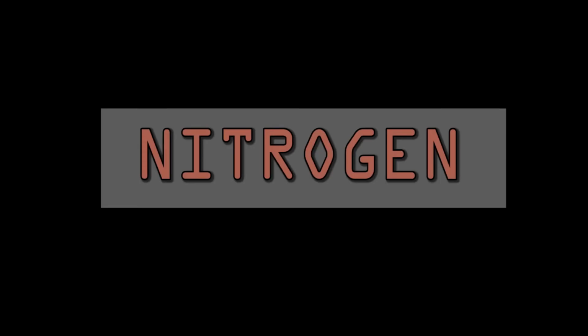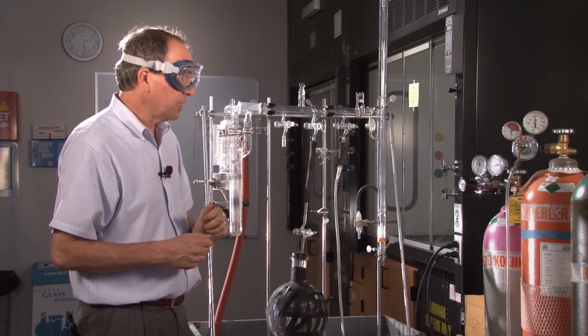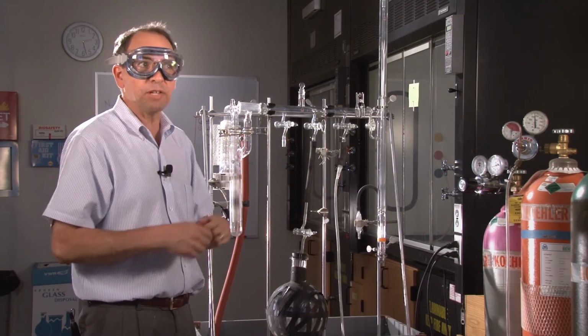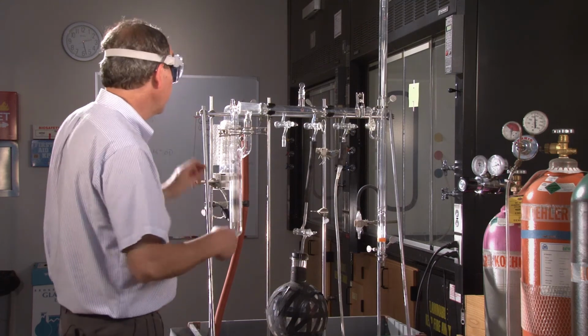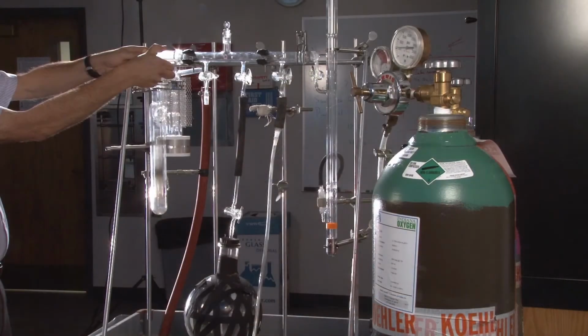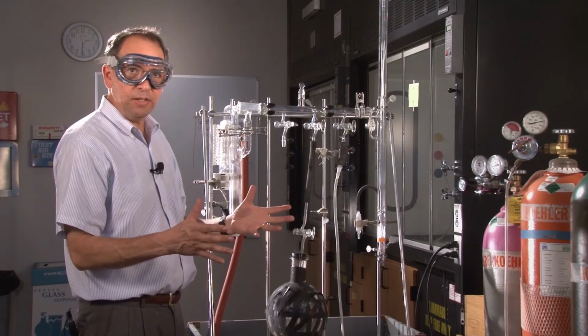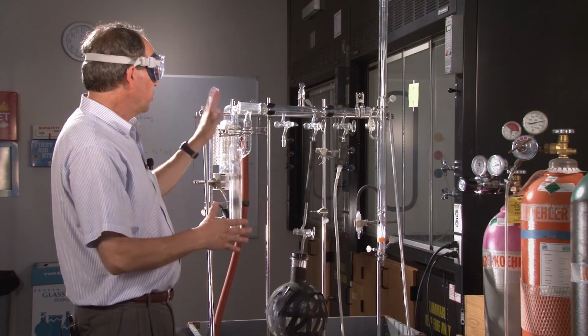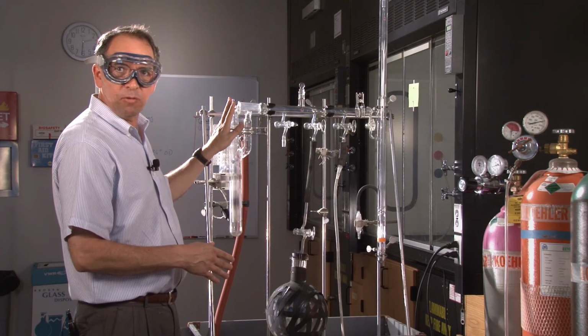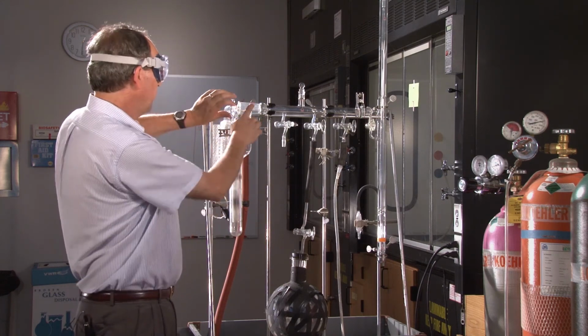We have now connected the gas port to the nitrogen cylinder, and now we're going to re-evacuate the entire unit again. So now once again we're going to shut off the manifold from the vacuum pump, and then we're going to open the valve and fill it up with nitrogen.